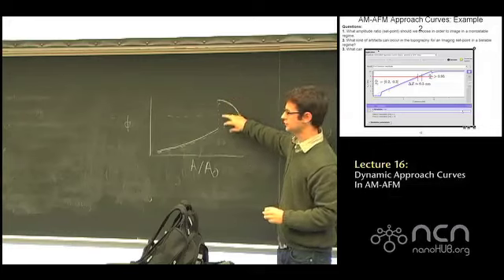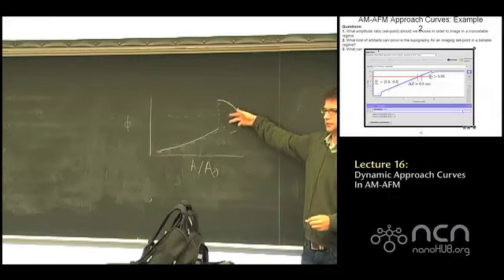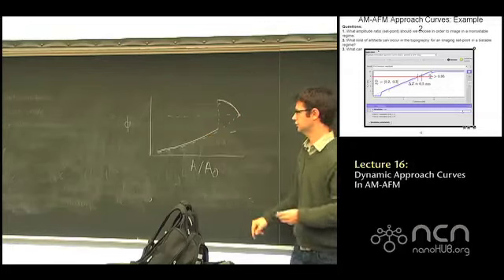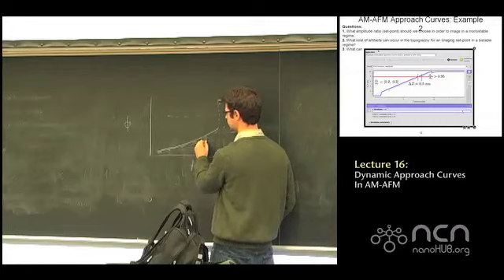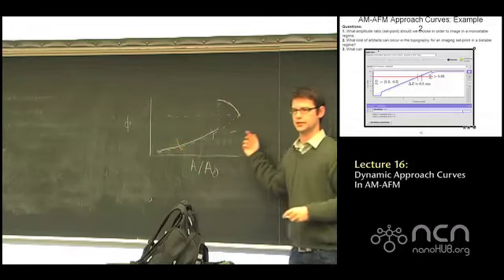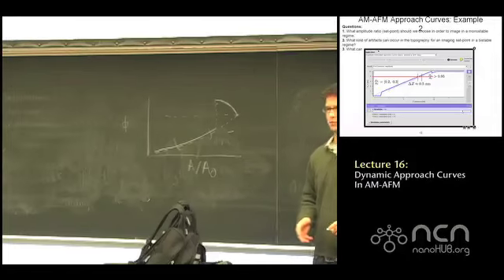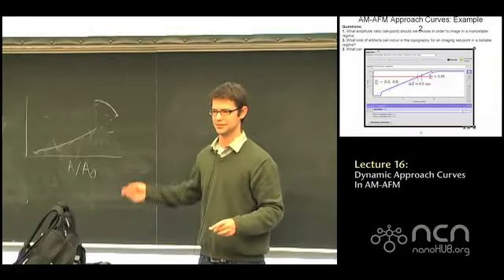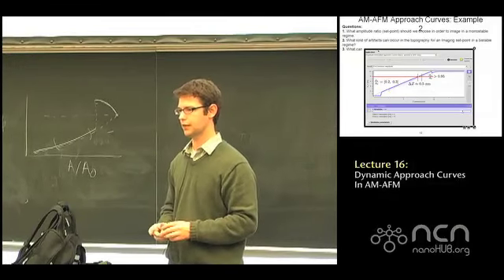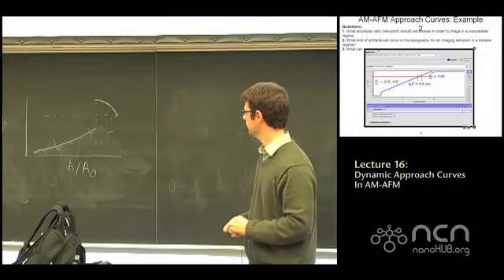So the bistable regime will have two branches which look sort of mirrored from each other, but eventually they'll join in the repulsive regime. This will have to be less than 90 degrees, and both curves from the approach and retraction should be very close to each other. It won't be perfect because it's an experiment, but in the simulation they'll be on top of each other, almost exactly.